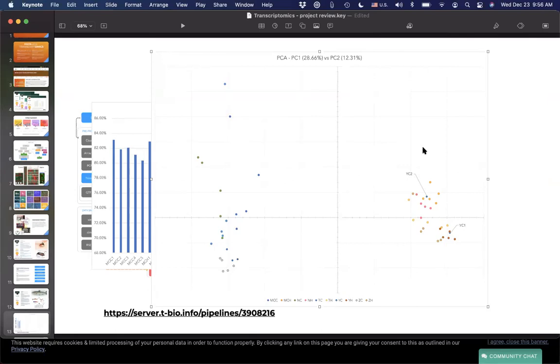So I think this is something that definitely you could redo this and just try and see that what you are seeing is what's expected, and then do all kinds of comparisons within specific groups, just controls, just Ys, just specific types of comparisons.